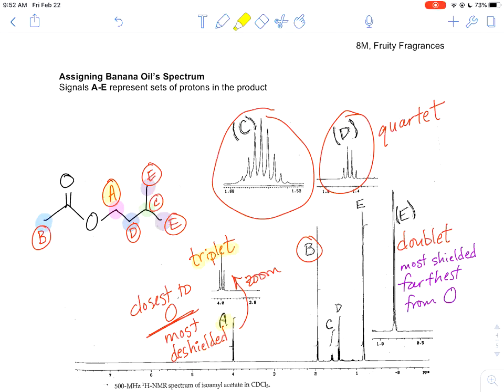This one here, we had a singlet. B, we identified over here as the only singlet, the CH3 group. We had signal C, that multiplet was the methine or CH proton, and the only quartet had to be signal D. The only doublet was signal E, the remaining CH3 groups. So we went ahead and assigned everything.